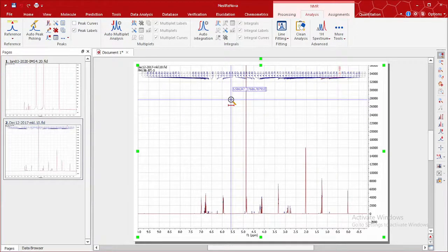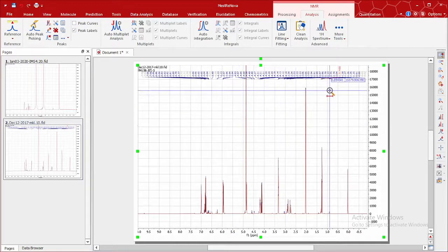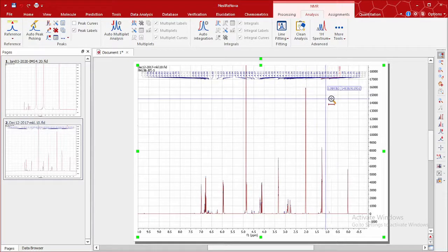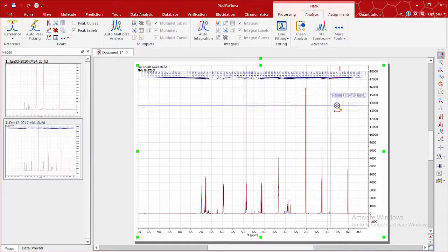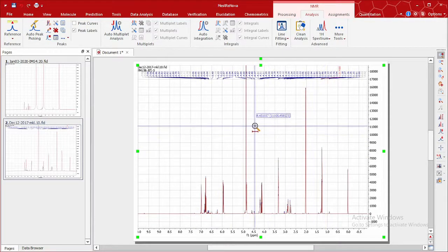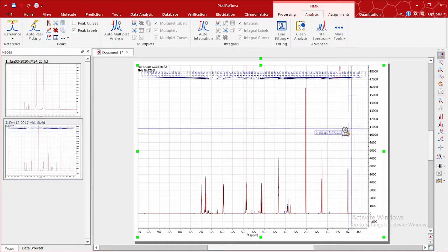One of the disadvantages of automatic peak picking is that when you have a Proton NMR spectrum with impurities or other artifacts that also have a chemical shift, it is going to deposit numbers designating their chemical shift. These numbers are called chemical shifts. So the disadvantage is that the peaks for the artifacts and impurities also have their own chemical shift.